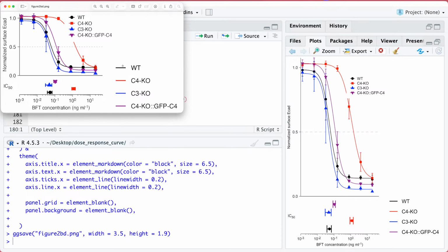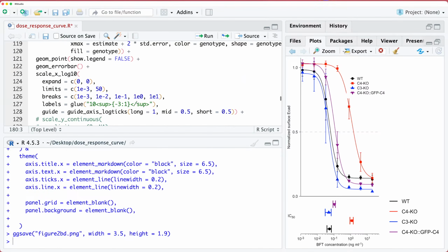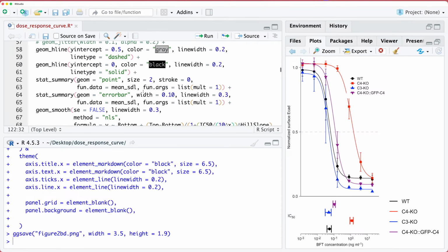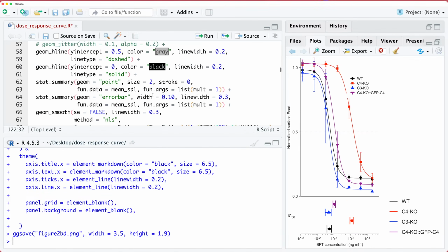And this is showing up as a legend. So let's go ahead and make the lines a bit more thin. And we'll do line width equals 0.2, which is, I think, what I used up above, right? So back up here, we used line width of 0.3.